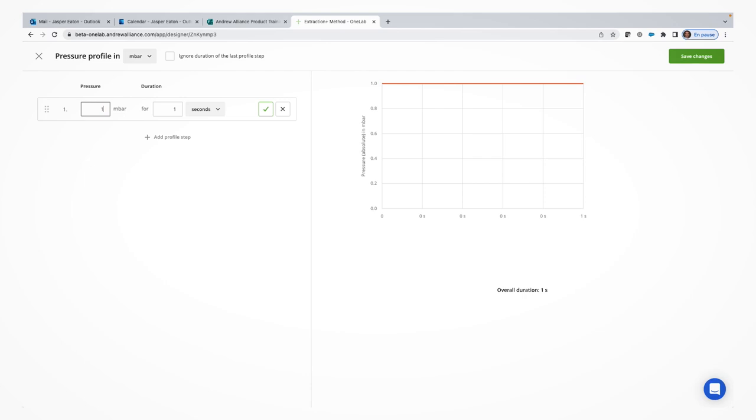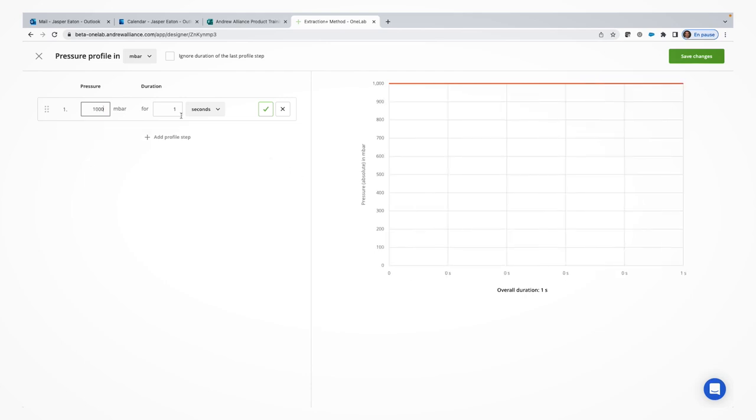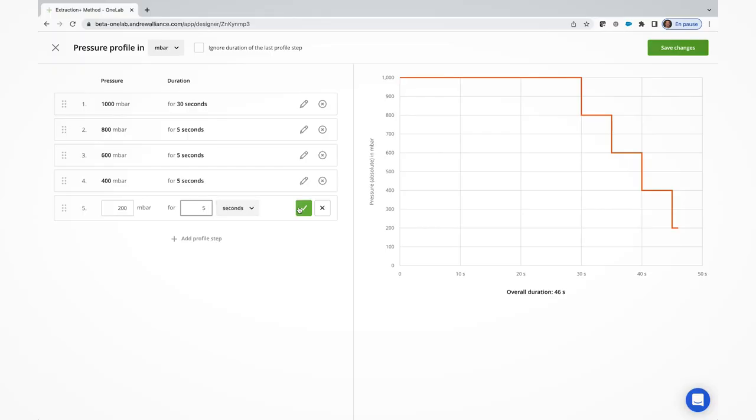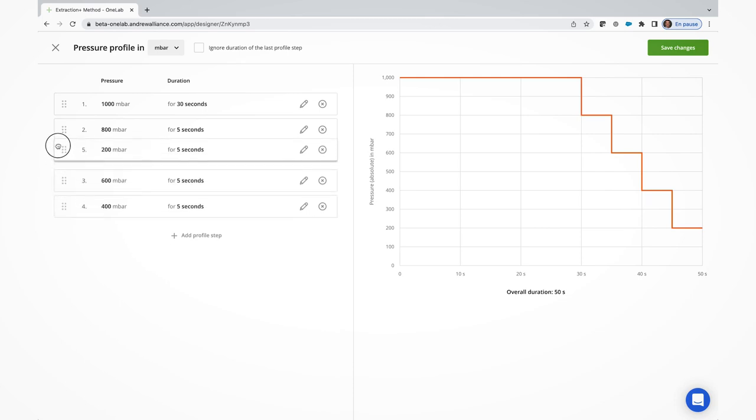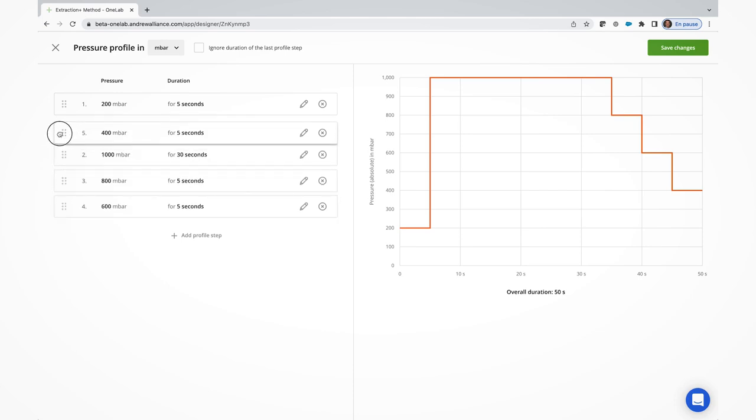Ticking this button brings up an all-new interface where you can define an automated sequence of various pressures, each with specific durations. Set your first profile step with your desired parameters and click on Confirm. Then add as many new profile steps as needed and rearrange them with a single drag and drop. You'll see that the chart on the right readjusts to show you a visual representation of your selection.